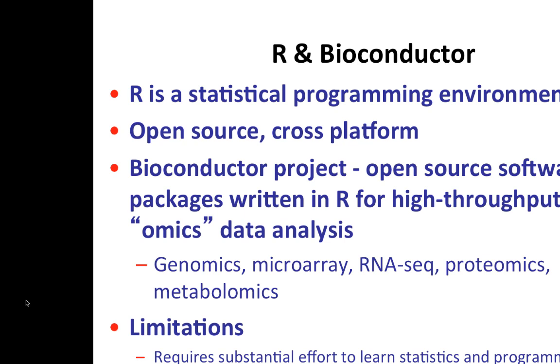Especially if you're doing metabolomics, it's R and XCMS like today, but a lot of people also do omics like microarrays and RNA sequence analysis. R and Bioconductor have a lot of packages to help you do that. So learning R is really worth it. As Michelle mentioned, at the start you probably feel a little intimidated because of the command line and typing, but with strong motivation you can overcome it. Once you overcome the first stage, you'll find it very useful.